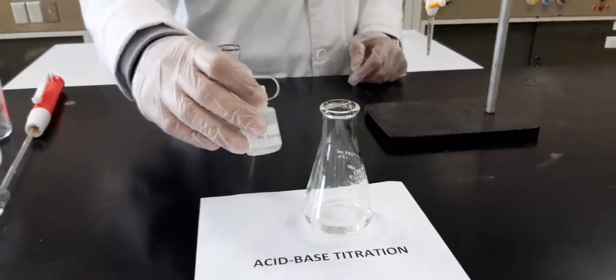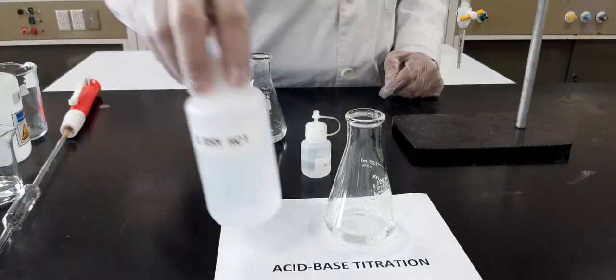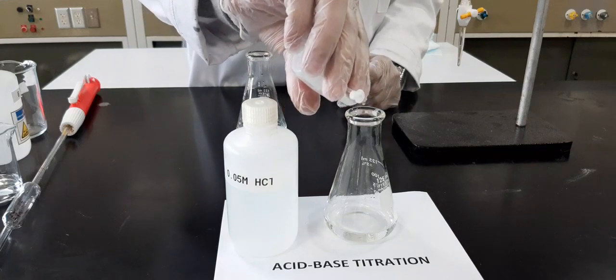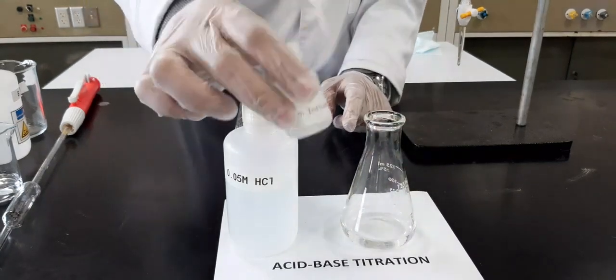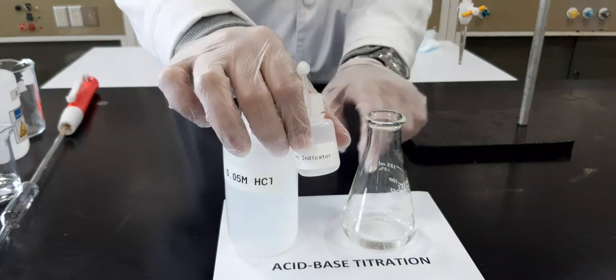So what we do actually, this is our acid solution, 20 ml acid solution, this one. We have to add to the conical flask 2 drops of indicator. Do you see any color change? No. So that's why we say that this indicator, phenolphthalein, does not show any color with acid solution. We call it colorless.